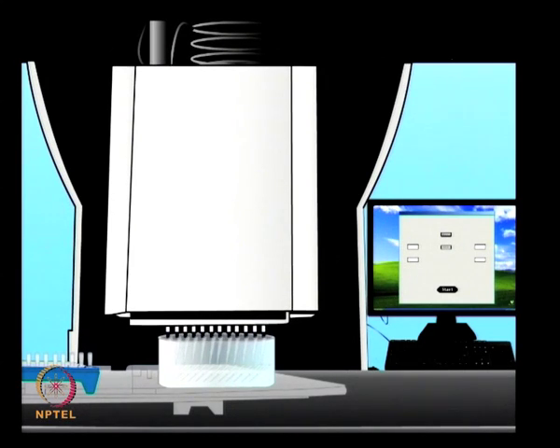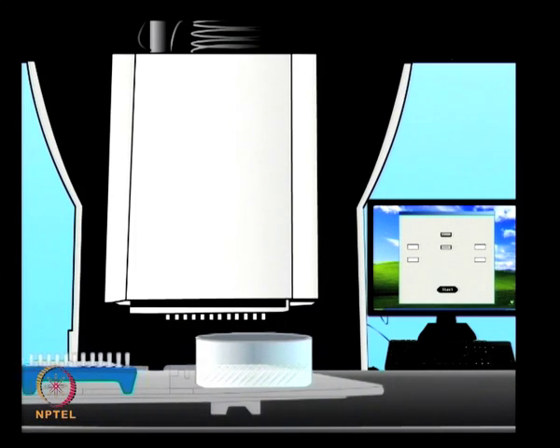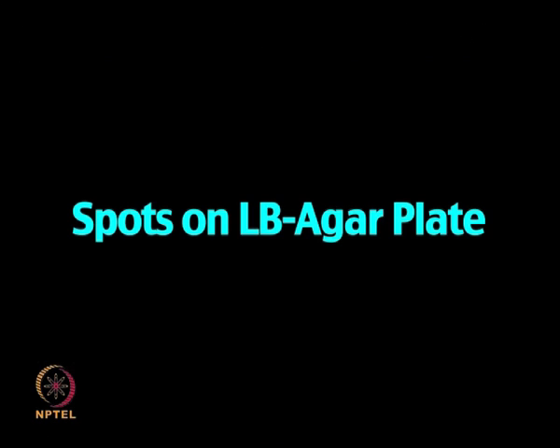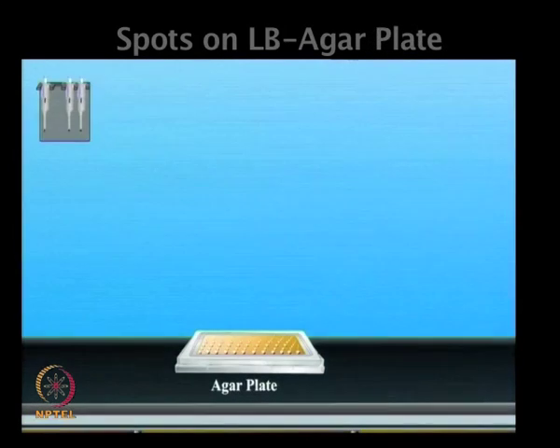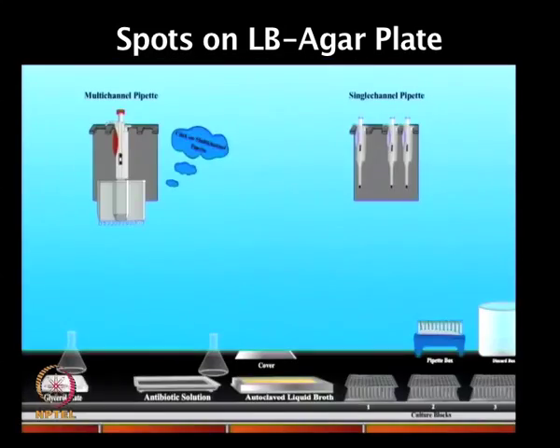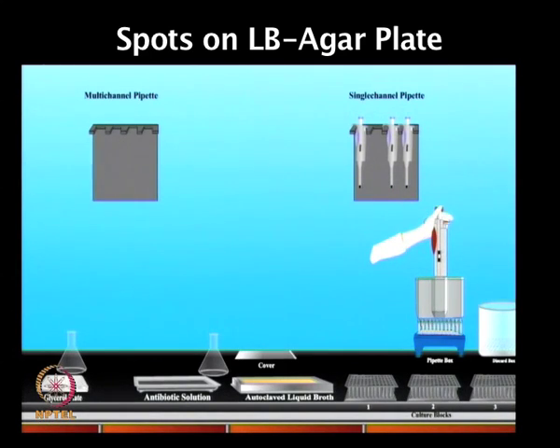It is preferred to do this in 96 well plate format, so that you can avoid any mislabeling of the samples. Allow the bacteria to grow overnight at 37 degrees before inoculating into the liquid medium. As shown here, you can use a multi-channel pipetter or you can also use the liquid handling system.